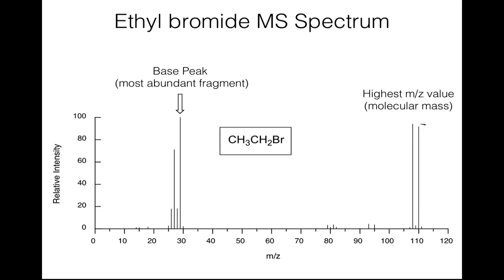To determine the molecular mass in a mass spectrum, look at the highest mass or m/z value. This makes sense, because the highest possible mass should be the mass of the molecule of interest, while masses lower than the molecular mass would be the fragments of the molecule. Therefore, the peak all the way to the right of the spectrum, at the highest m/z value, is the molecular ion mass, or the M+. Except when there are isotopes present in the molecule, such as carbon or halogen isotopes.